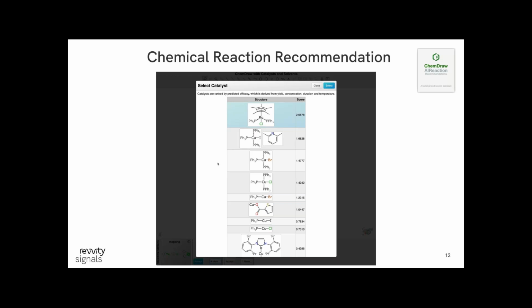The goal is really the practical details like safety and hazard, environmental aspects, but it brings these tools right within the hands of the chemists or the scientists who are at the bench doing this. And rather than replacing the chemist expertise, we're guiding them through it if they need this. And I'll say we're currently evaluating its performance, so we do need feedback from synthetic chemists that really understand its accuracy and utility. And what excites us most isn't just this specific application, but how it demonstrates the potential to integrate intelligent assistance exactly where the scientists need it in their workflow.